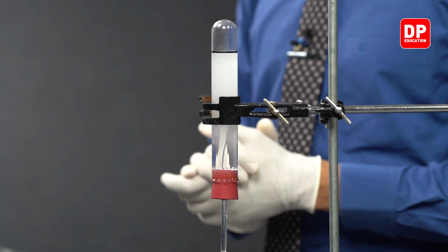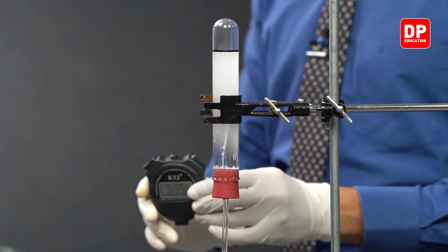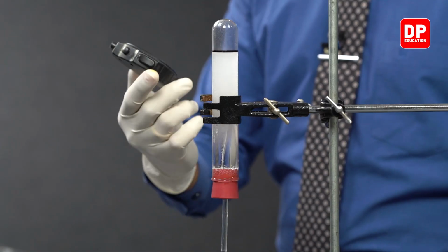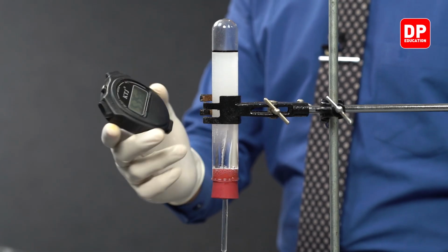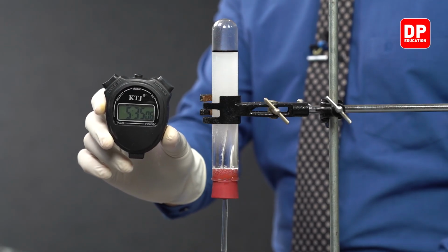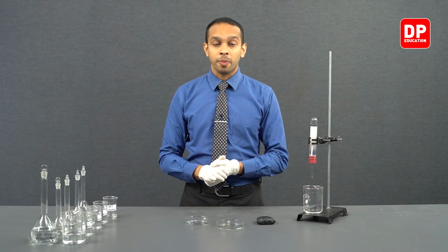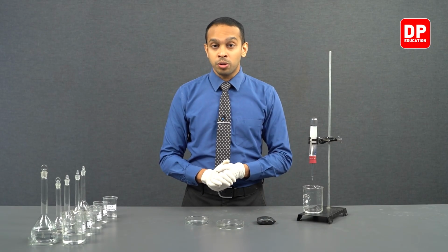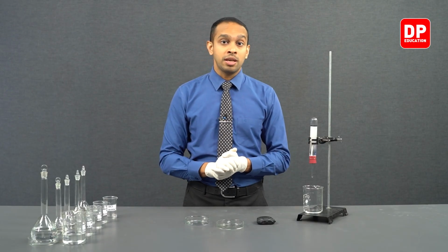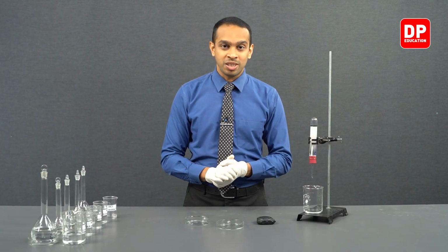Students, now we have collected hydrogen gas up to this level, and the time it took for that reaction to take place is 5 minutes and 35 seconds. So we will make note of that time, and then we can move on to the next reaction, where we will be reacting the magnesium strip with an HCl solution that has a 0.4 moles per decimeters cube concentration.